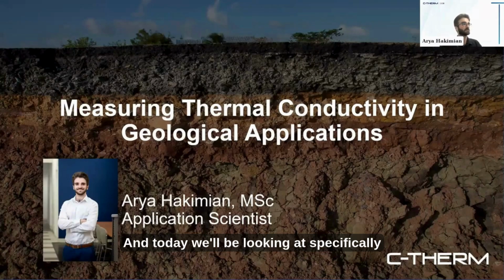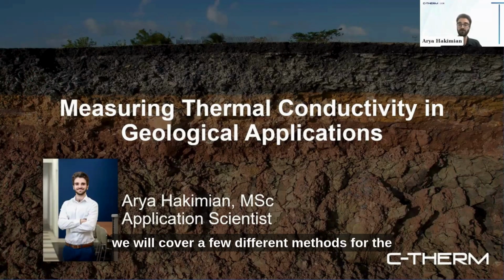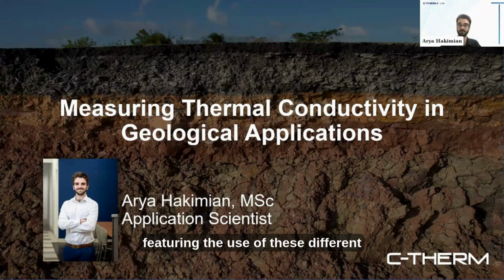And today we'll be looking specifically at the application of thermal conductivity in the realm of geological material testing and related applications. So in today's session, we will cover a few different methods for the characterization of these materials, as well as go over a few different examples, both some we've collected internally and others that are publications featuring the use of these different methods.